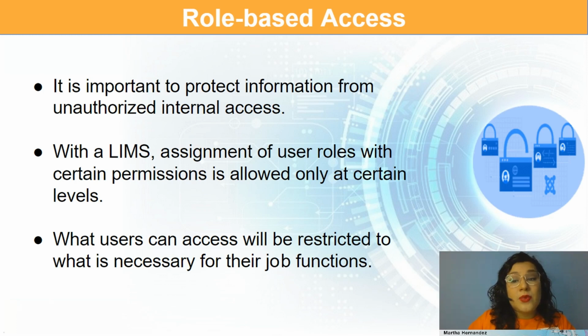Role-based access. It is important to protect information from unauthorized internal access. This requires the assignment of user roles with certain permissions, only at certain levels. And you have to know what users can access and which one will be restricted to what is necessary for their functions. So let's see how LIMS helps you with this.